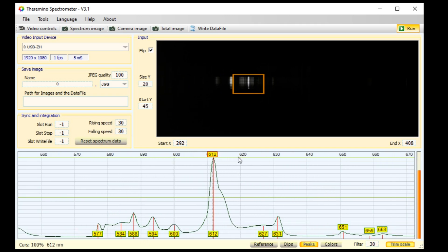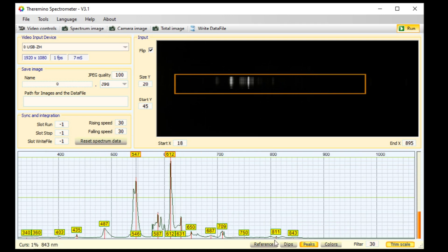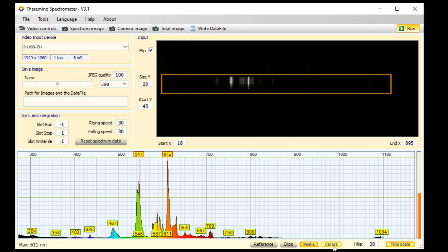Zoom out until you can see the 612 trim point. Drag it near the other peak, then scroll to zoom in and position it perfectly. You are now calibrated. Let's zoom way out and we can enable the colors now — the colors didn't make sense until now. I'm going to turn off the trim points as well by clicking that button.